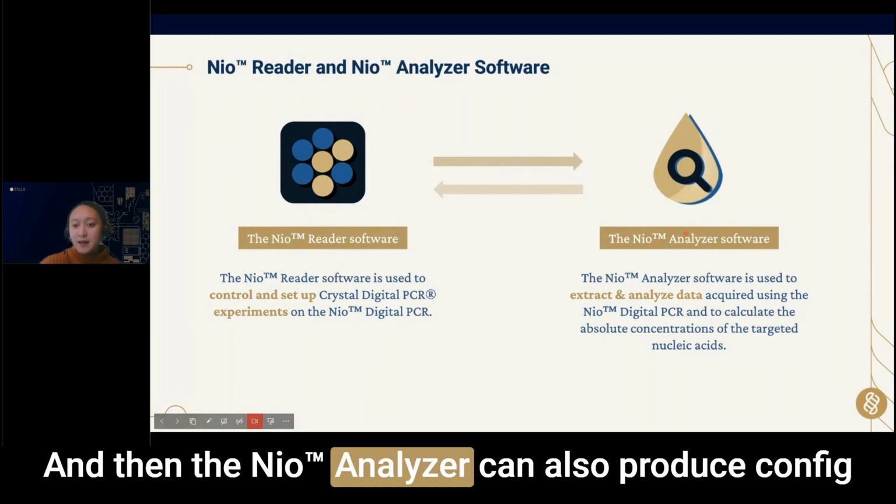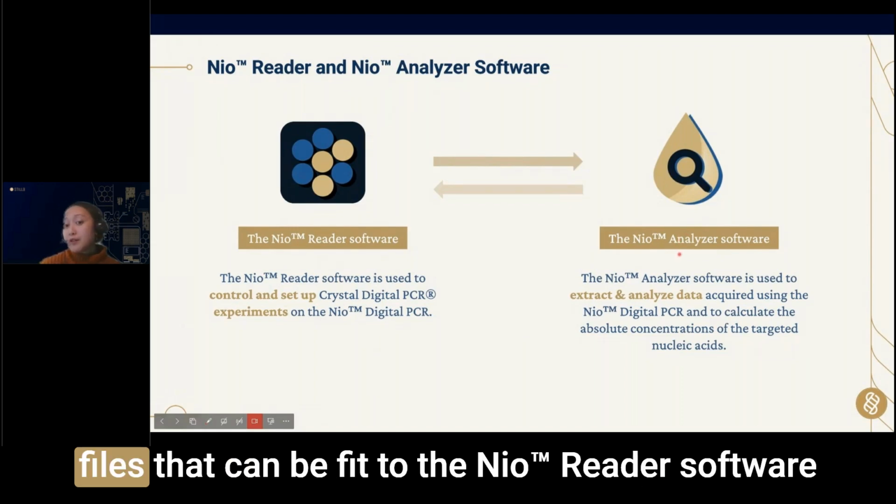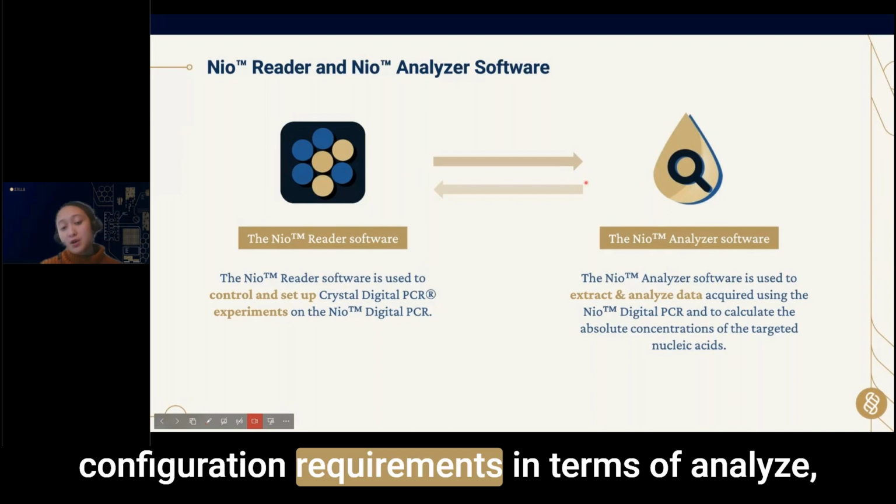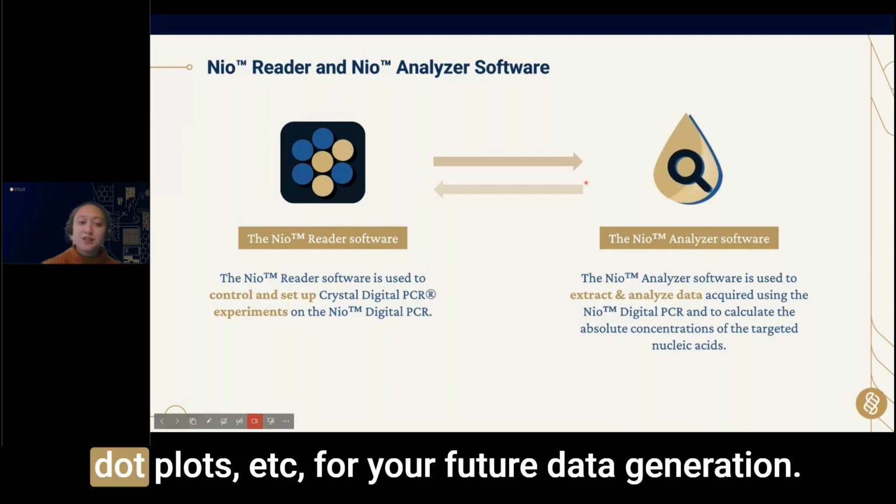And then the Nio Analyzer can also produce config files that can be fed to the Nio Reader software so that your future data will already contain all the configuration requirements in terms of analysis, dot plots, etc., for your future data generation.